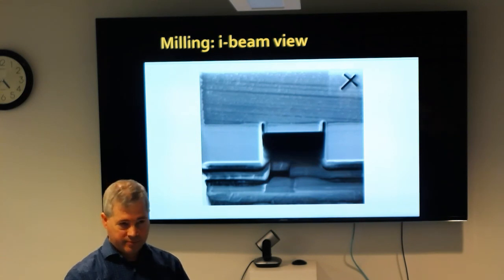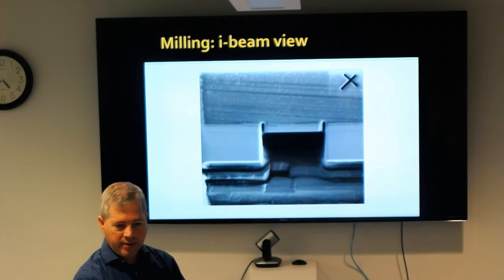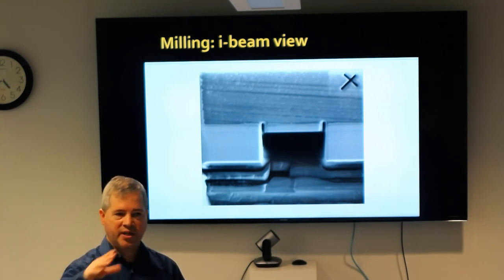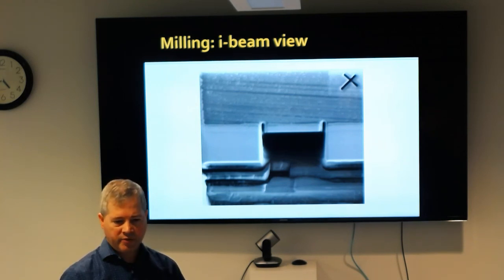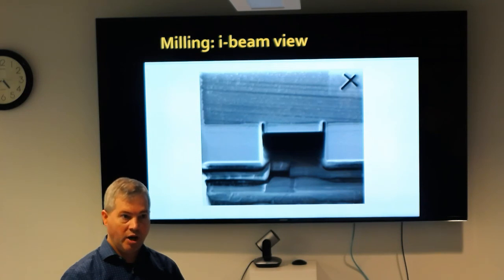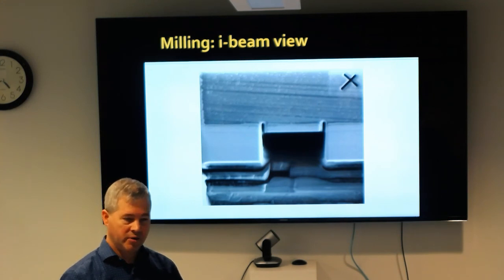Like in material science, with higher ones, you get the gallium redeposition all over the place. I don't know. Biological material is different, and it necessarily won't adhere to it. The first time I did it, I saw some redeposition of little blobs on the surface, but I think I was hitting some of the grid bar and sputtering copper onto it. I don't think we've seen any. There will be some doping or penetrance of gallium into it, but I don't think we've ever really seen blobs of gallium. And when we're getting to the fine milling, you're usually doing it at a pretty low current.